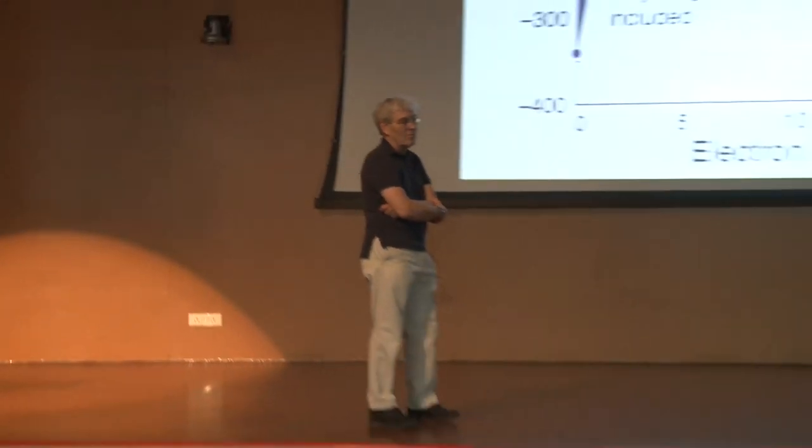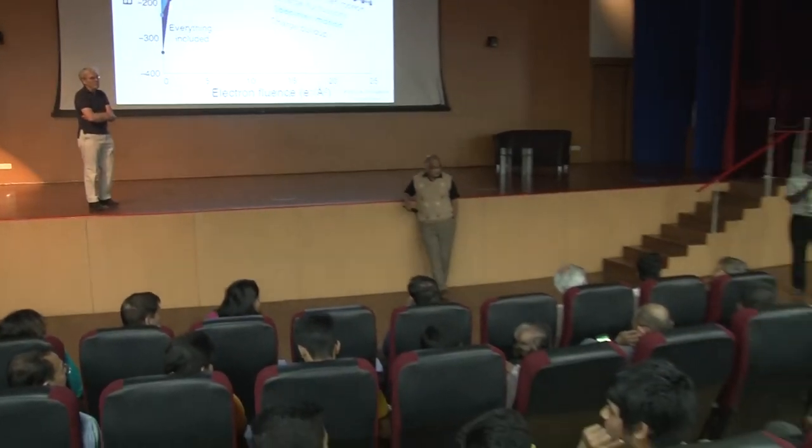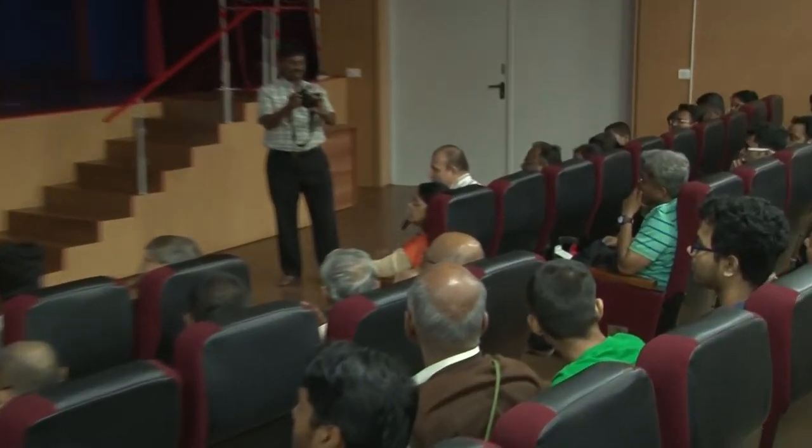Yeah, I have one question. There are three techniques that you compared, the NMR, the imaging technique, and the X-ray crystallography. So has there been an attempt to solve the same structure by all three, and then try to understand the conflicts of analysis? And is it the biofunctionality which decides which is getting better and which is worse? That is one question.